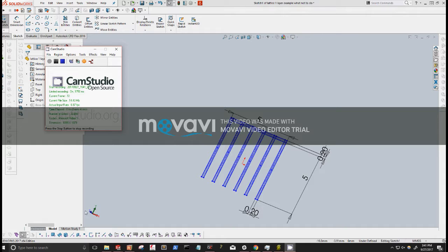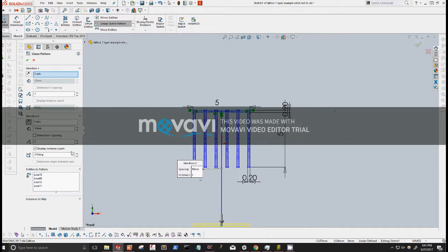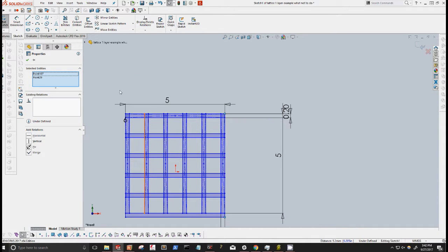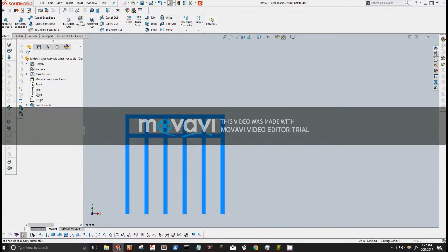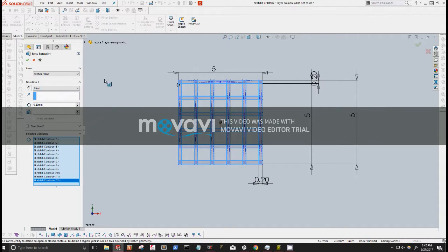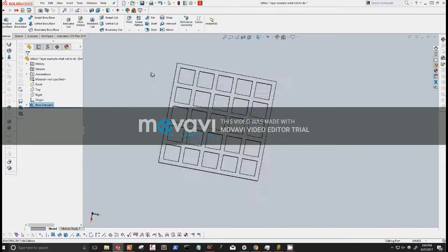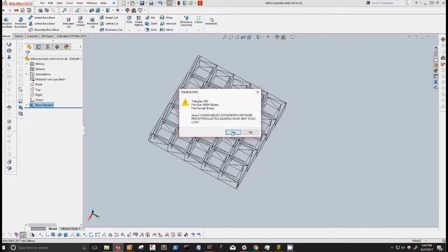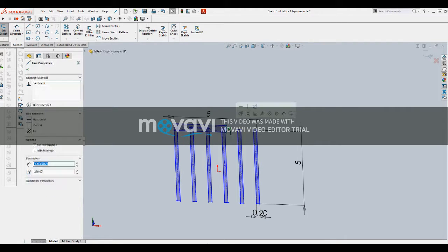Okay, so we just reviewed how to design your lattice file, but what are some lattice designs to avoid for bioprinting? Here is one example. Here, you can see this design combines the first two layers from the last video in one layer, creating a checkerboard. This may seem like a straightforward method for creating your lattice design, but we will see in Slicer that this design does not lead to an optimal toolpath. This design does not require an assembly, but will not give you an optimal bioprinting result. We'll save it as an STL to use as an example.